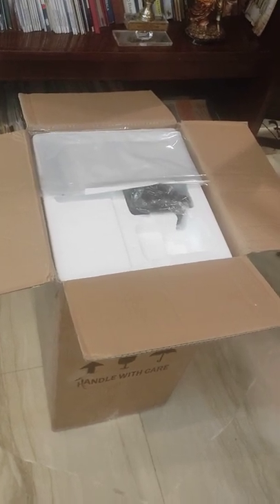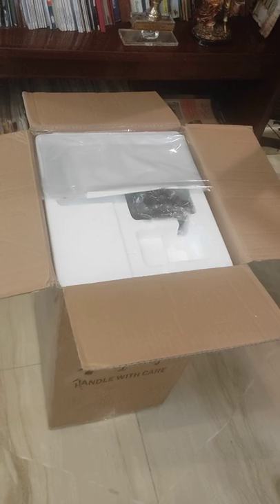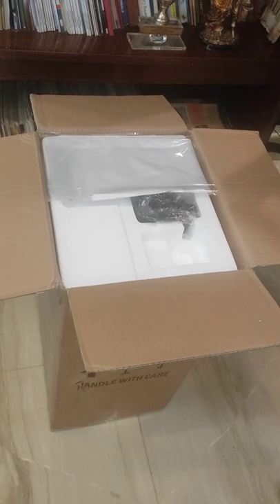Hello folks, today we will show you the unboxing of Fluorescence Microscope model KFL 30.